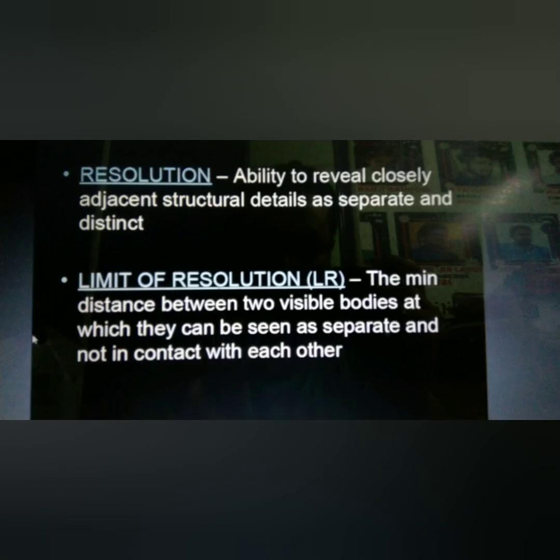Okay, next. Out of this, resolution is more important, because without a good resolution microscope one cannot identify the various parts of a small biological sample. For example, in a biological cell there are many cell organelles, so whenever you are staining the sample and looking under the microscope, without a good resolution you cannot differentiate between the various cell organelles. Okay students, next.